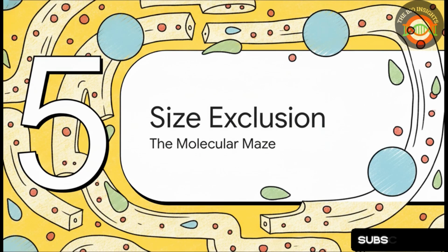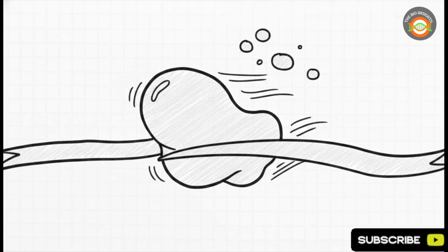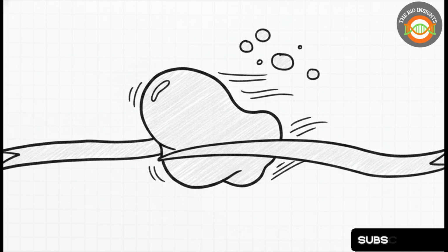All right, moving to section 5, size exclusion, the maze. Okay, get ready for a totally counterintuitive rule. In size exclusion chromatography, sometimes called gel filtration, the largest items actually win the race. They exit the column first, while the smallest items exit last. No way, right? It seems totally backwards until you actually look at the structure of the column itself.